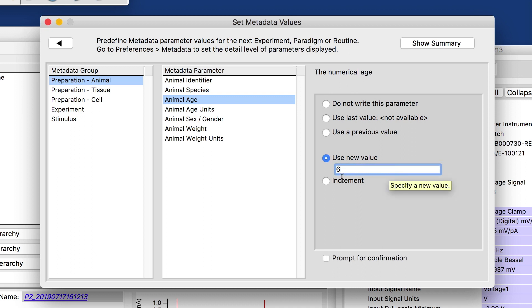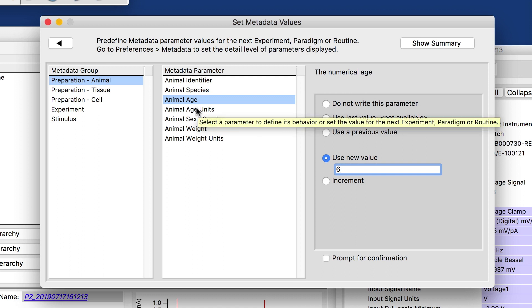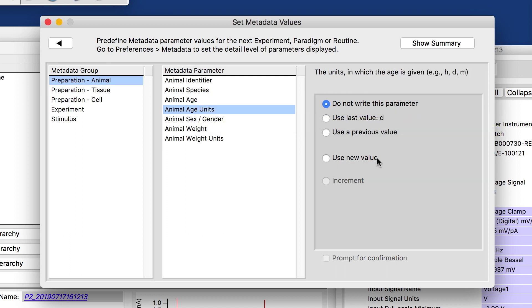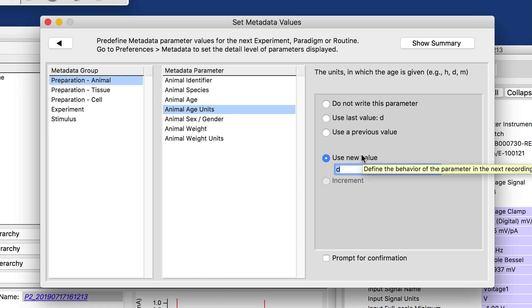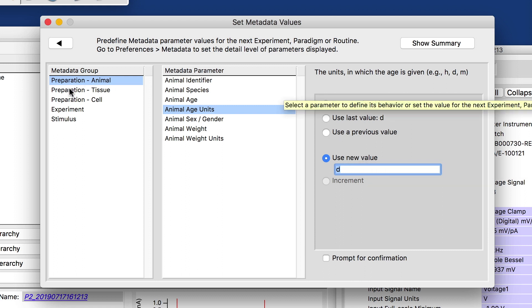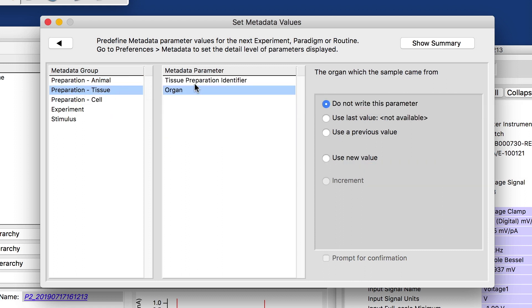And I purposely put a numerical value here so I can make an age row or something like that, because my age units would be six days. So young mouse that we recorded from the tissue, for example, we would use brain. And there would be a brain slice.